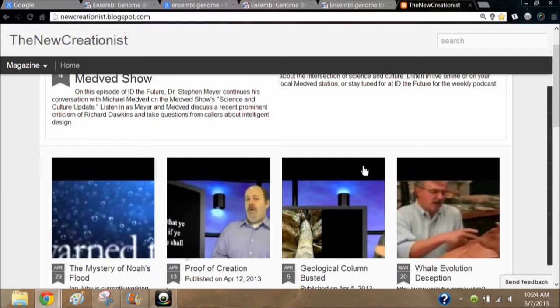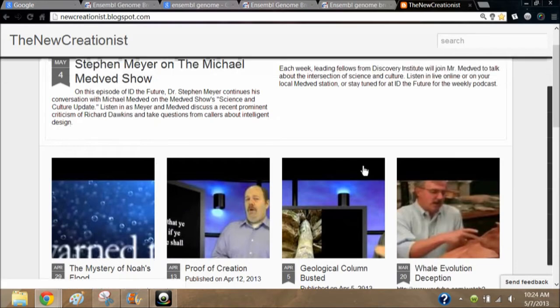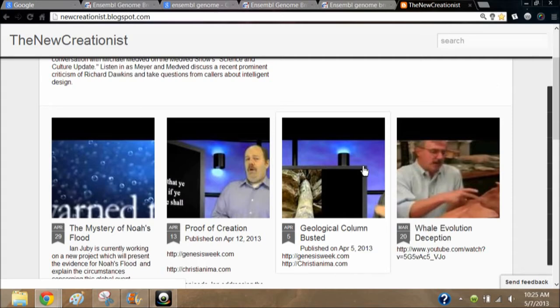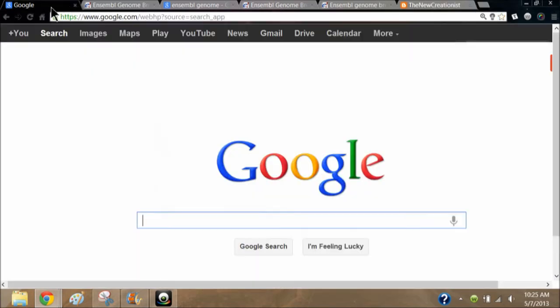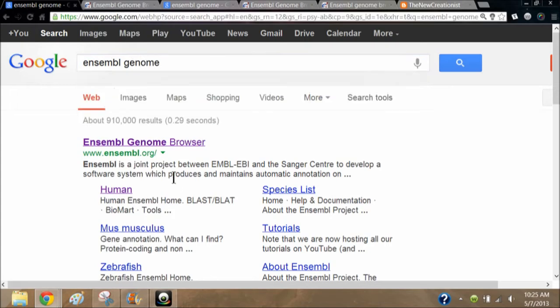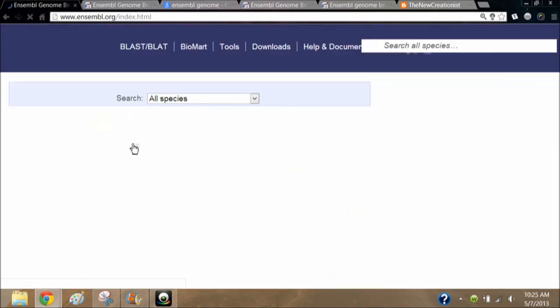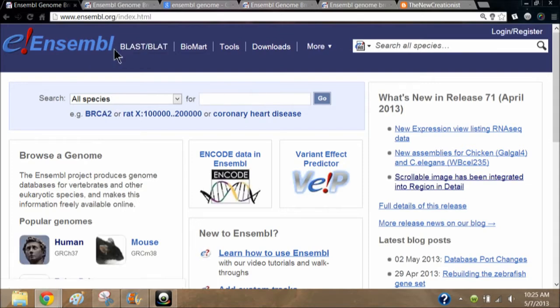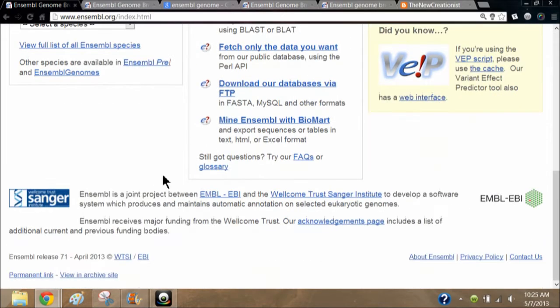Hello and welcome to the New Creationist. I'm Eugene. Today I'll be showing you how to use the Ensembl genome browser to run genetic comparisons between different species. To get to the Ensembl website you can simply type in the URL or enter 'Ensembl genome browser' into the search bar and follow the link. Please notice there's no 'e' at the end of Ensembl. We'll be using the most recent version, which is release 71 as of April 2013.